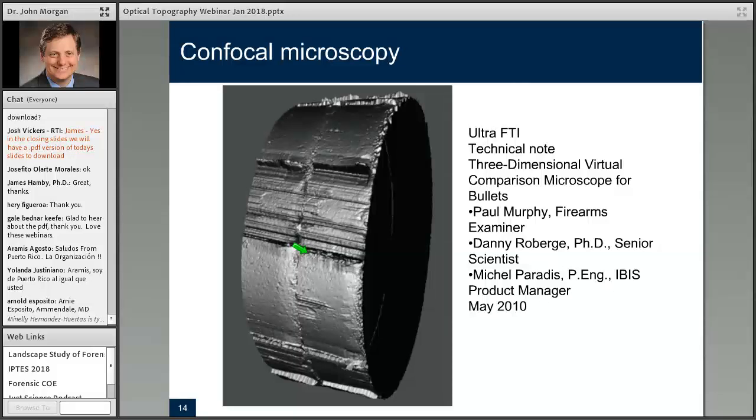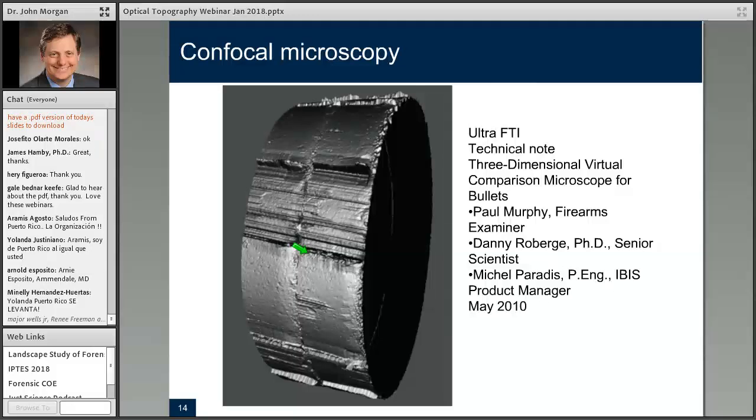One of the things that we need to keep in mind is that when we start to do matches, even with cartridge cases, which of course are a little easier, a little more predictable, we can see some score matches that are really, really astounding, and you say, well, gosh, this is definitely a match here. But again, sometimes the brain is too good of an image processor, and we can be fooled. And we can also be fooled by looking at a score and over-interpreting what it is telling us.